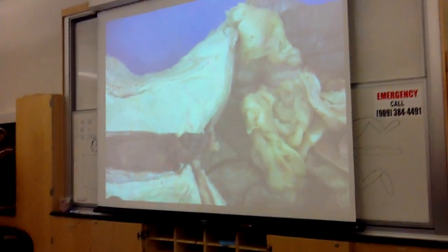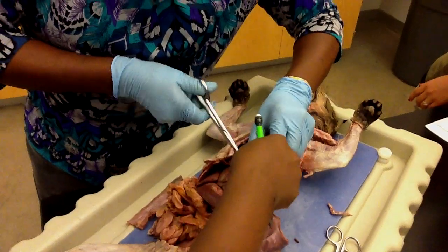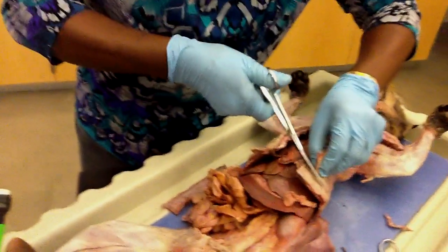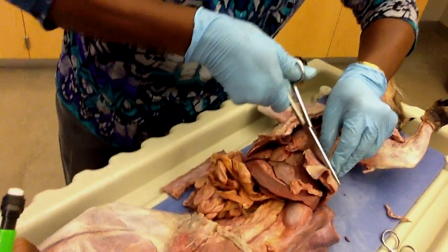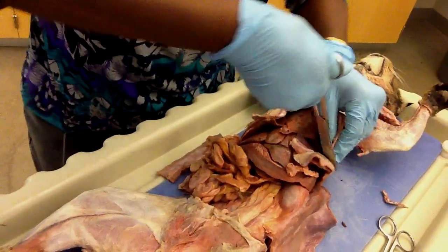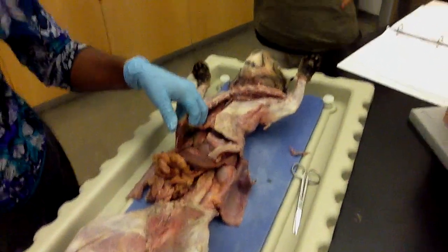Okay? Who's finished the cuts then? Okay, got it. Like coming this way. Four groups here. Who else? Got it. And just right there. Along it. We're gonna have a little bit of skin there, though. Yes. Just stretch the two rib cage parts open, like this.